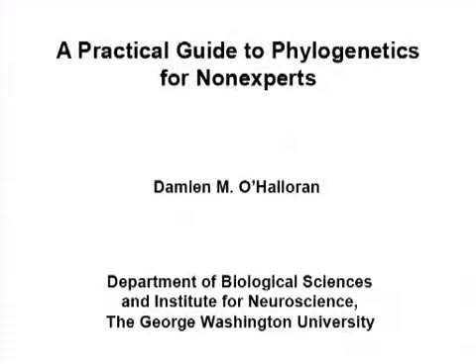The overall goal of this article is to reconstruct a reliable phylogenetic tree from DNA or protein sequences. This is accomplished by first identifying similar sequences using BLAST programs at NCBI. The second step is to align similar sequences.